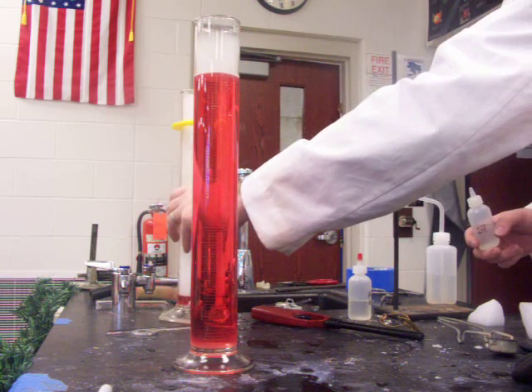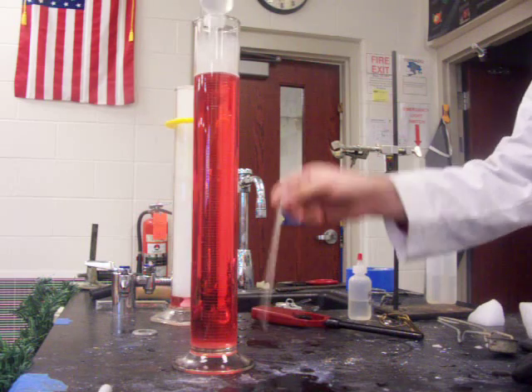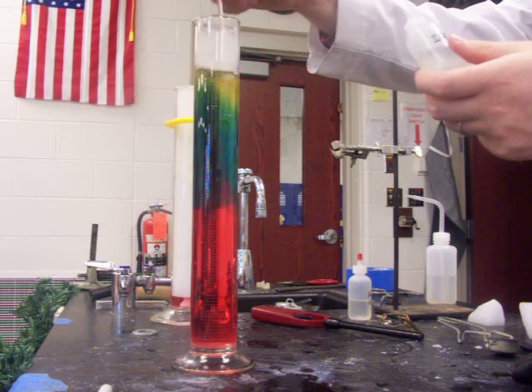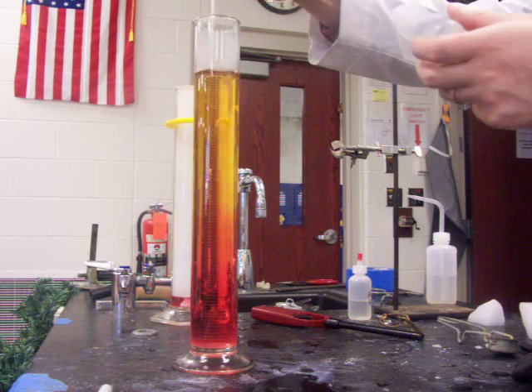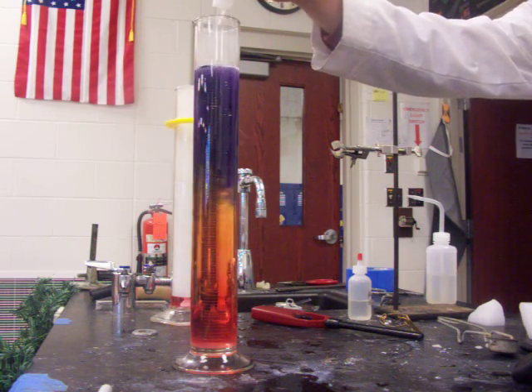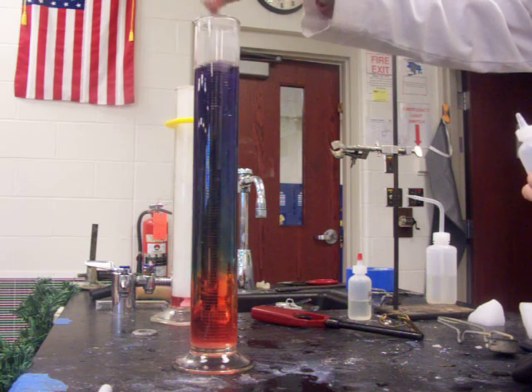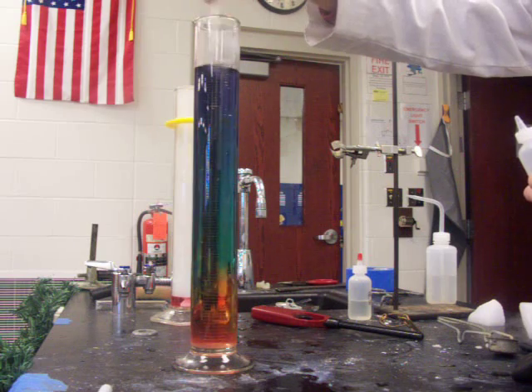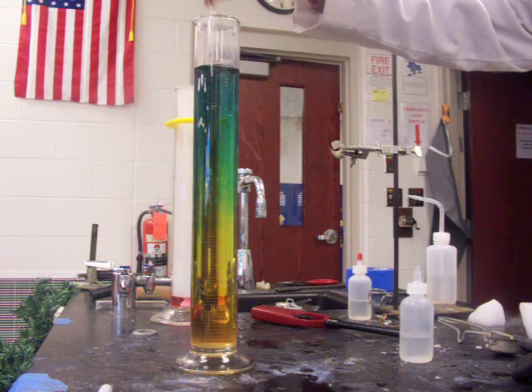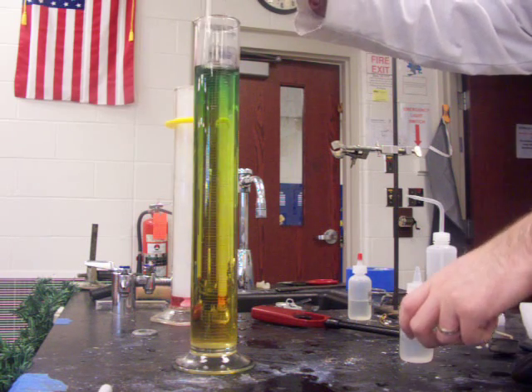To get the original green color back, and hopefully all the way — it's still mostly yellow. I'm adding the base back and you can see the color changing in layers here. As I stir it in, it's equalizing the pH, so right now the top is basic and the bottom is still acidic.